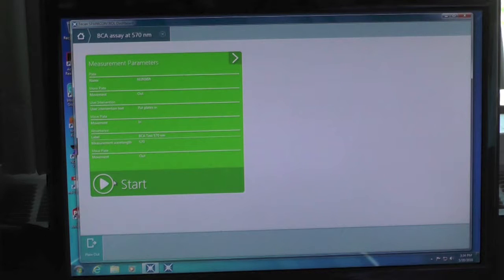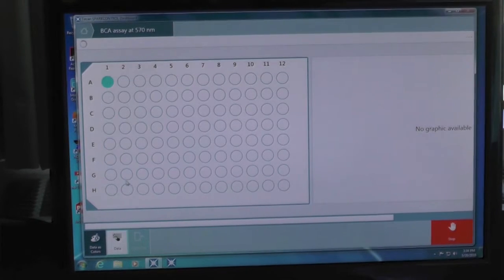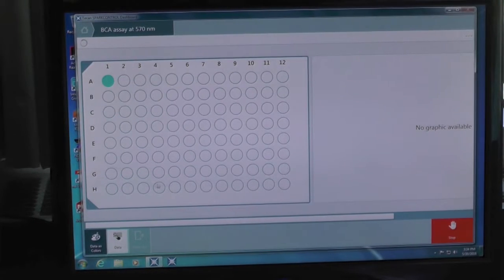Then you will come to a screen where you can view the detailed setting of the assay. Quickly review if this is what you need to perform your microplate reading. When confirmed, click start and the method will begin.